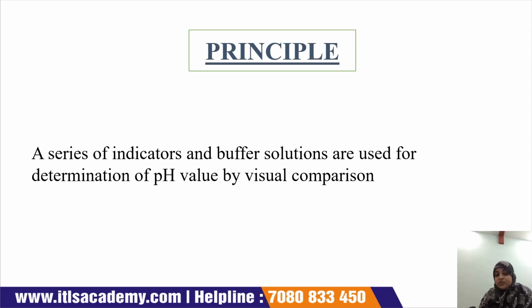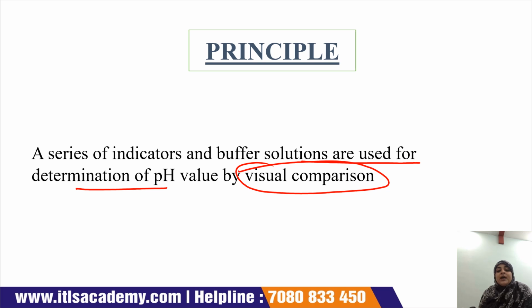Now the first one is the principle. A series of indicators and buffer solutions are used for determining the pH value by visual comparison. So there is a series of indicators and different buffer solutions used for determining the pH value by visual comparison.